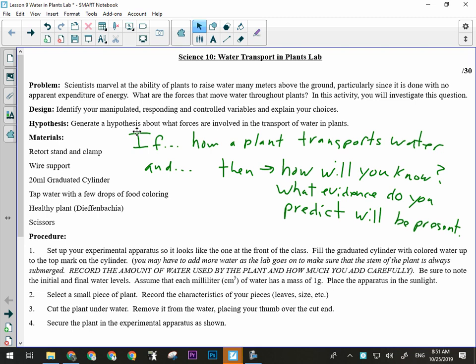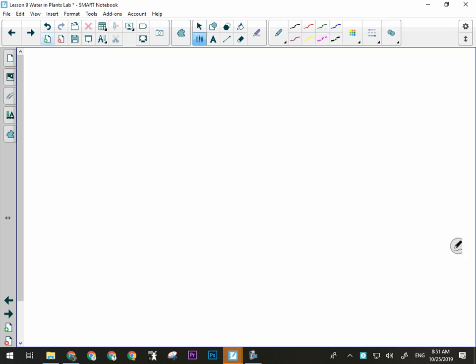Okay, one of the really big ones, one of the really small ones. The reason is that we want to have the plant sitting in the small graduated cylinder, but we can't measure the water level all the way to the top because the measurement lines, or graduations, don't go all the way to the top. So what we're going to do is take the small cylinder and fill it from the big cylinder.